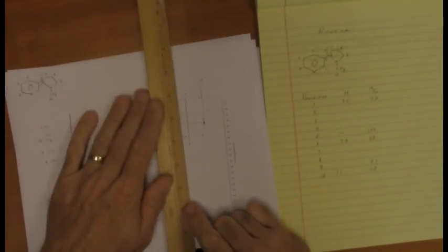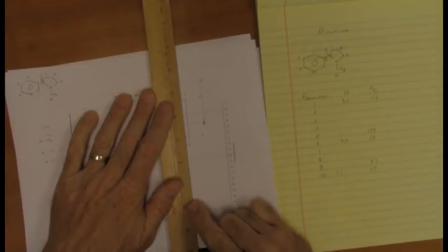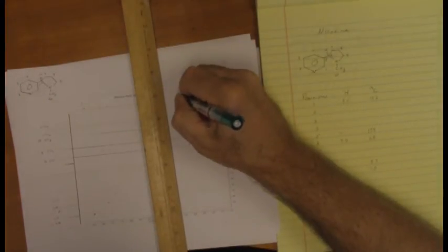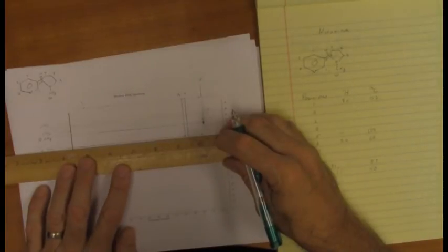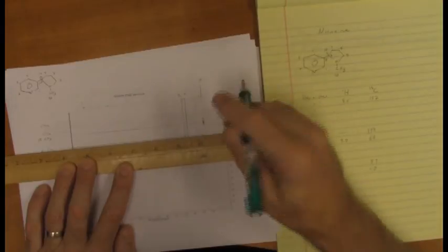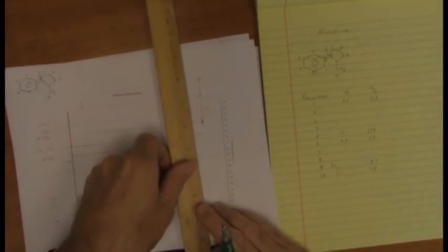There's one of them right there. Okay, and I'll go ahead, hit the cross peak, turn the thing, and come up there. That is one of the positions, one of the protons at position 9. That one looks about 3.1 to me. But I have to mark a second one, because if I continue moving out here, I come on this perfectly straight line to the second cross peak. There is the other proton of the CH2 group at position 9.